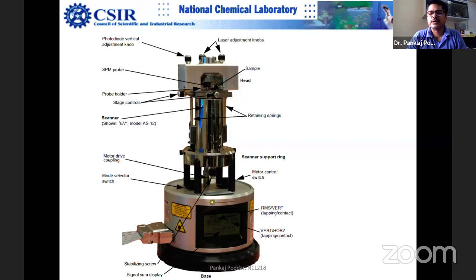So you can put an inflated car tire filled with sand. That also works fine. But these days there are active vibration isolations. Some companies are claiming that, including Park. Let us not go into that, otherwise it will take the entire lecture. I told you that the scanner is a very serious thing. Vibration isolation is an extremely serious thing. I have a dedicated lecture only on that, which will make you an expert in vibration isolation of any machine, including the electron microscope.